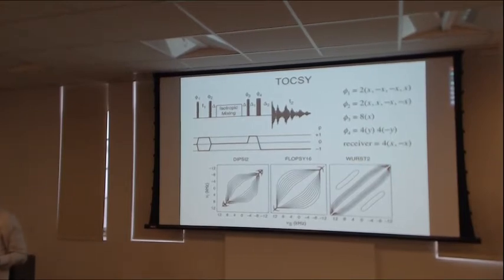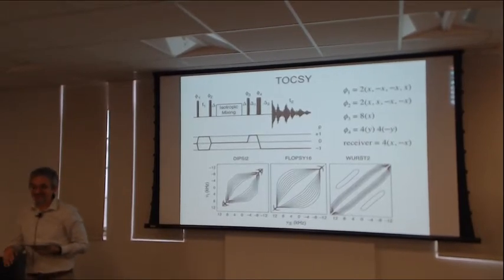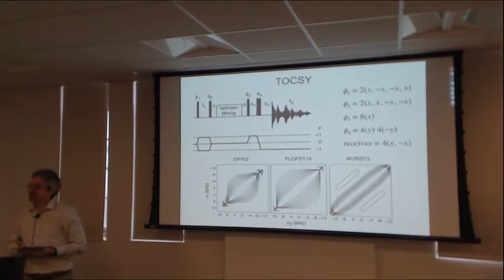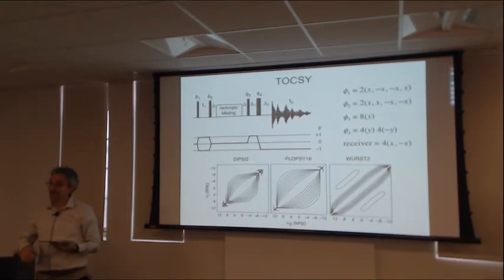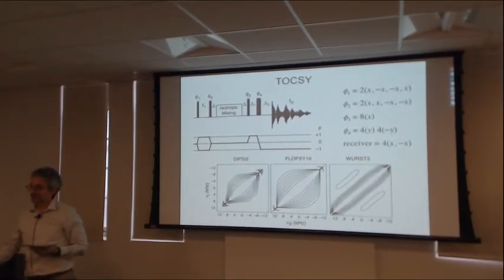It initially seems sort of silly in that you have a pulse sequence that you think of as averaging the J coupling to 0, and now you want to use that same sequence to average the chemical shift to 0. But it turned out that it worked, and when I started as a postdoc in '89, people were using WALTZ for doing TOCSY experiments, and WALTZ was at the time one of the best sequences for doing decoupling.